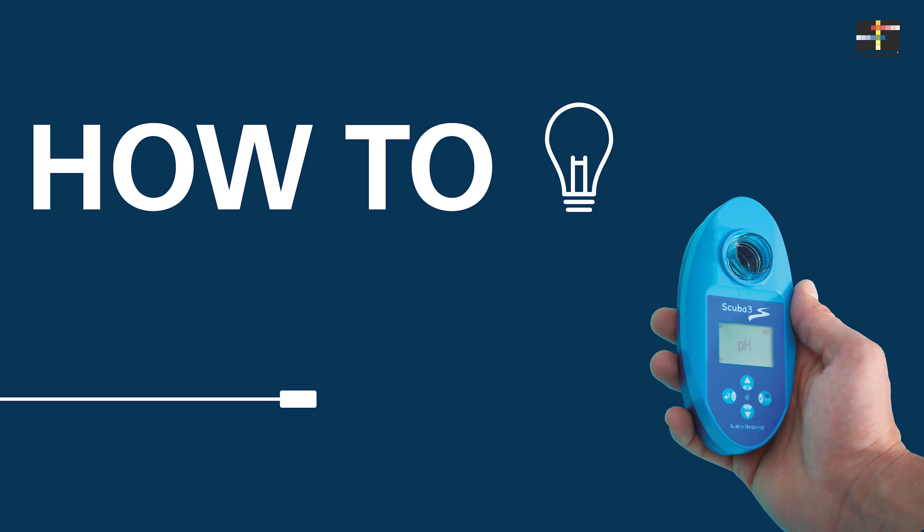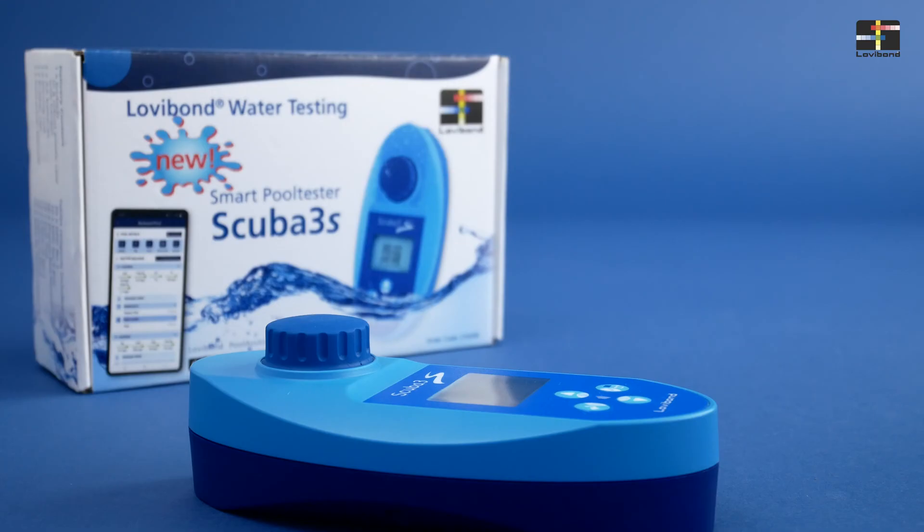Welcome to the product tutorial for the SCUBA 3S from Lovibond. Today we will show you how easy it is to take a measurement with this device.